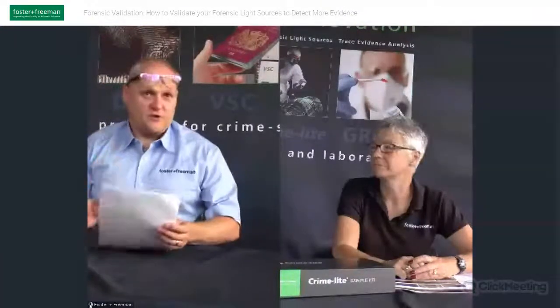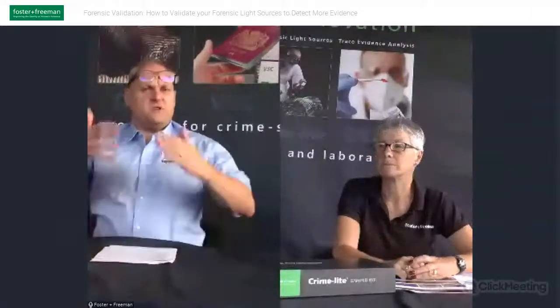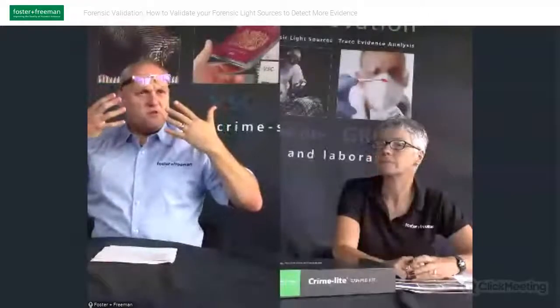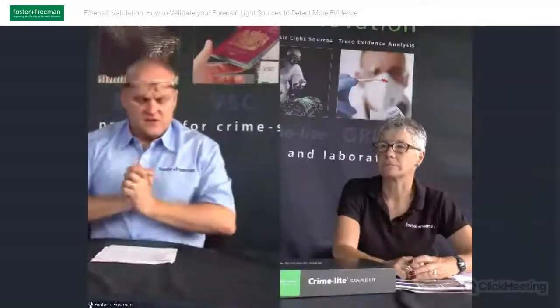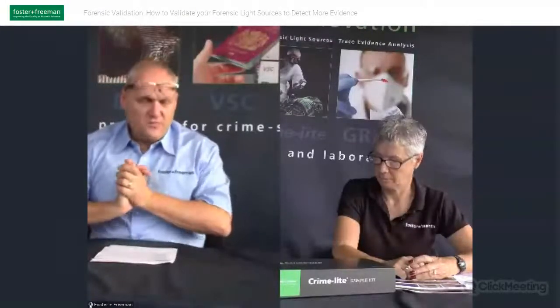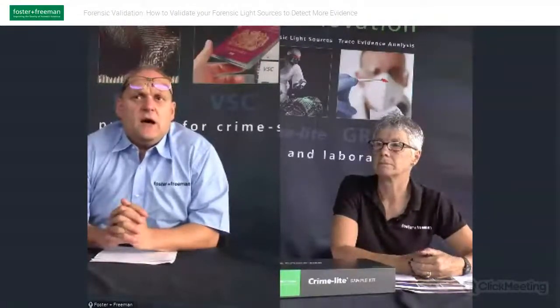Okay, so generally with the Crime-lite Auto, you don't have to use goggles. Because the goggles are your filter, but with the Crime-lite Auto, you're looking at the screen and the camera has the filter automatically applied to it. So you don't have to use goggles. The only goggles we supply with the Crime-lite Auto are actually UV protection goggles. They don't help you to see any fluorescence, because you'll see that on the back of the screen anyway, but they are there just for protection.